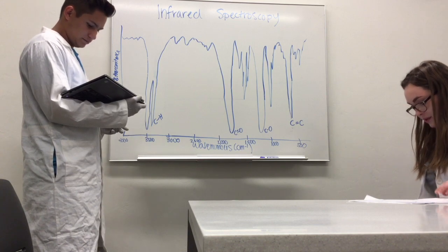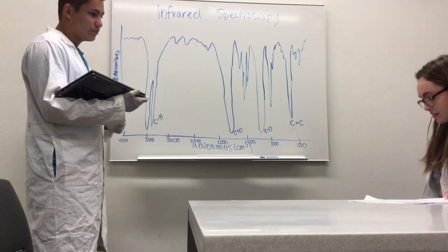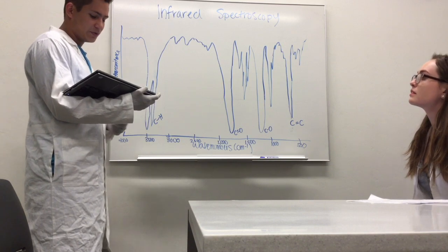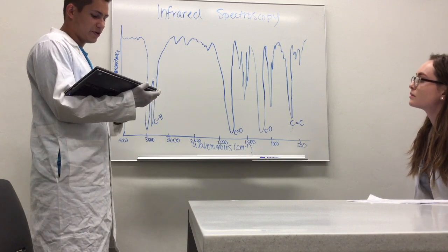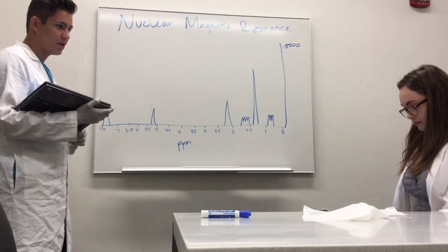Can we tell what bonds go to what substance since our solution is a mixture? Sadly, we can't tell which substances has what bonds. However, it helps us with our search because we know what bonds cannot be present in our solution. For example, we know hydrogen bonded to oxygen can't be present in either of our compounds.